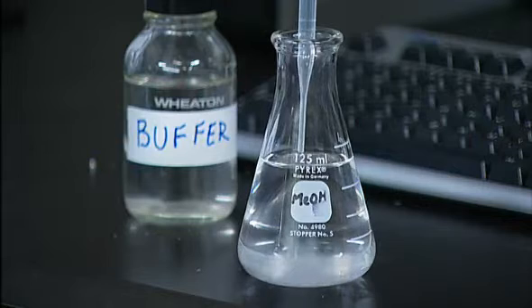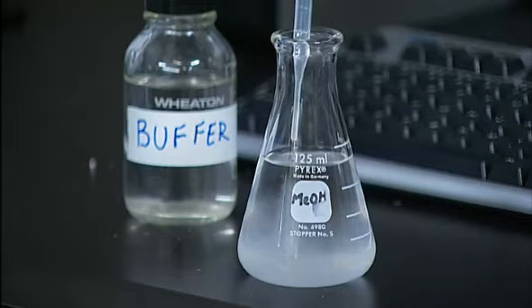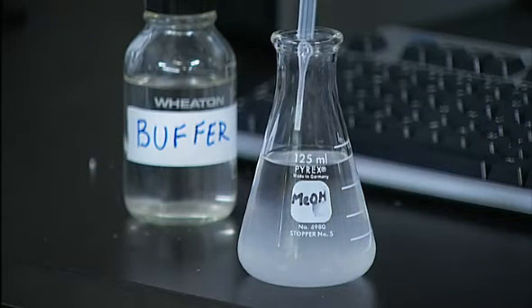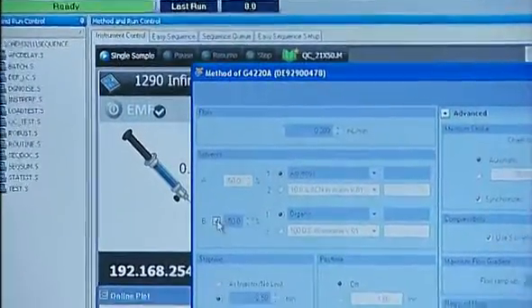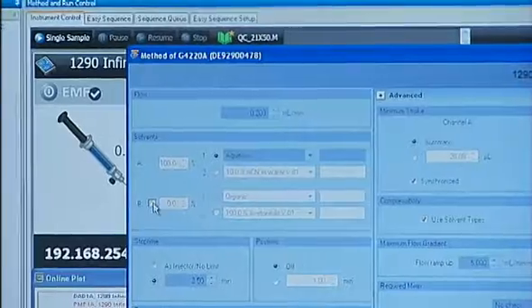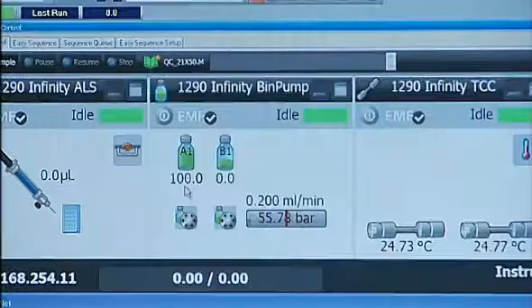I'd like to make a point about buffer salts. One of the contaminants that sometimes causes back pressure buildup inside the column is the precipitation of buffer salts. Somebody would have to put a very high concentration of organic solvent with a fairly concentrated buffer, maybe 50 millimolar, to get buffer salt precipitating out. The best way to remove these types of salts that are precipitated out is to run water through the column, because water will dissolve the salt.